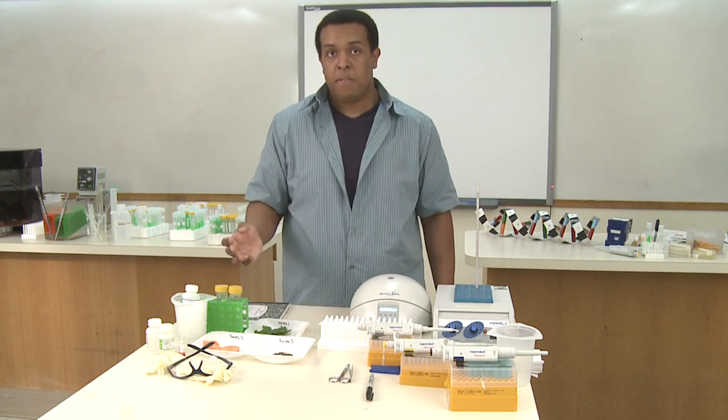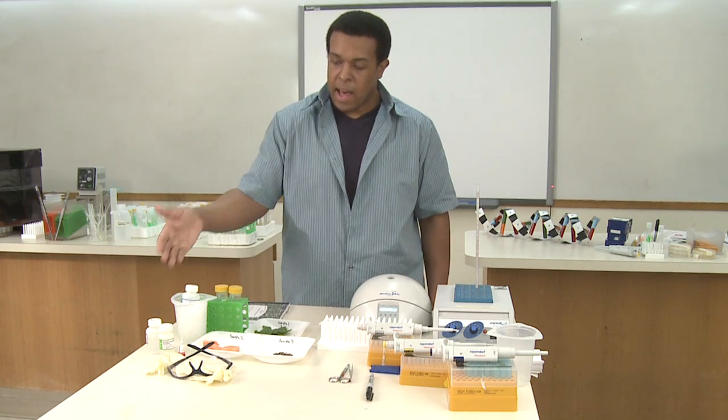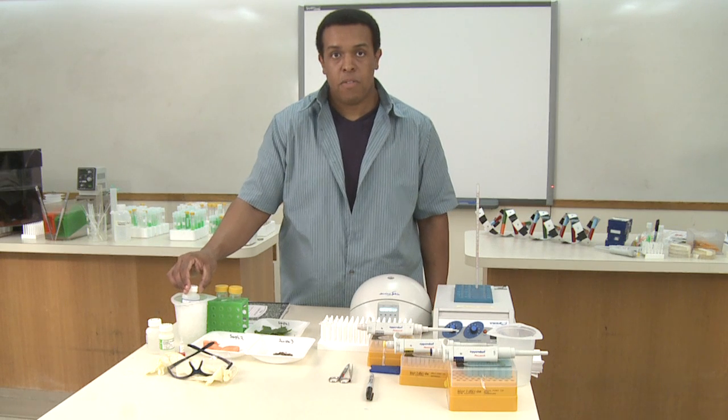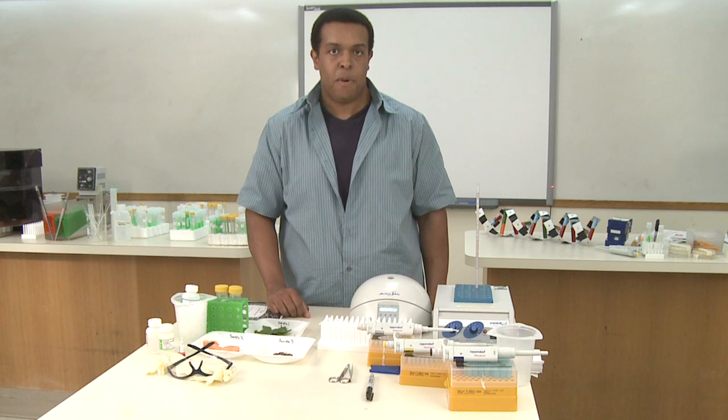Now, you may have your chemical reagents already aliquoted into smaller tubes. I have the full-size stock versions. Whatever you have is fine. Just be sure to follow the protocol so that you use the proper amount for each step.